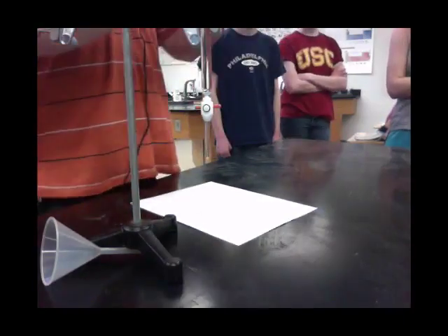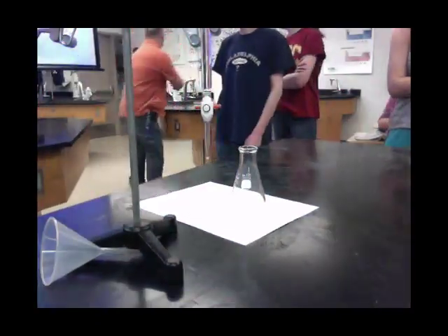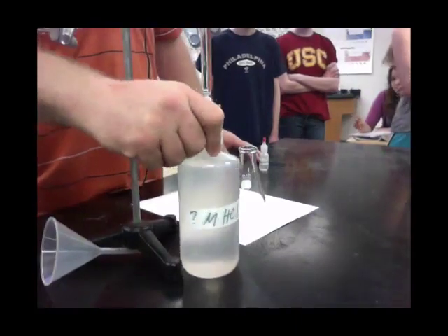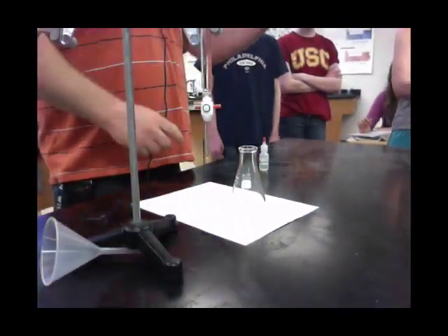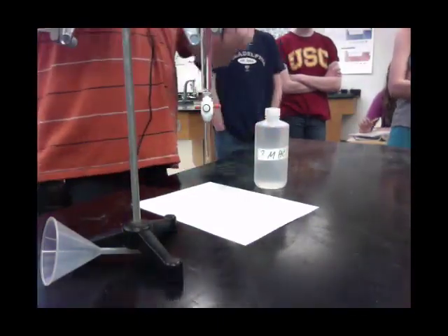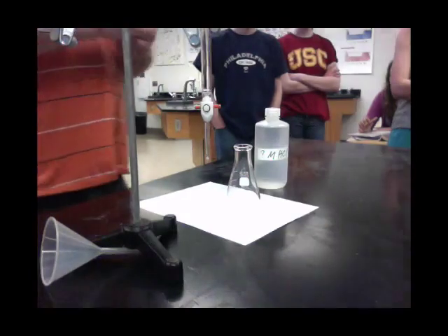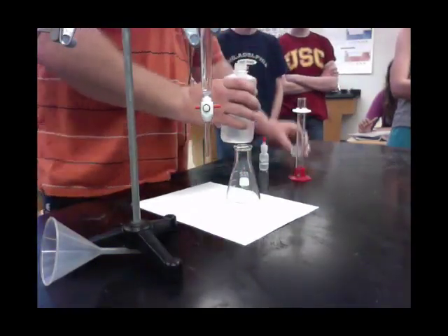Our unknown is some sort of hydrochloric acid. We have an unknown hydrochloric acid solution and we don't know what the concentration is. We're going to put as much as we need — in this case, 25 milliliters — which is convenient because we have a nice 25 milliliter graduated cylinder. So 25 milliliters goes in here.